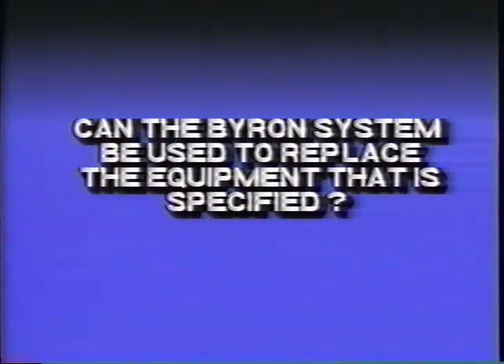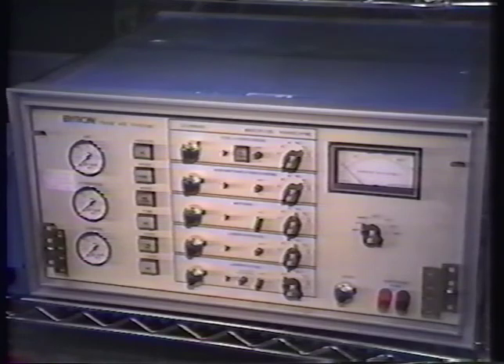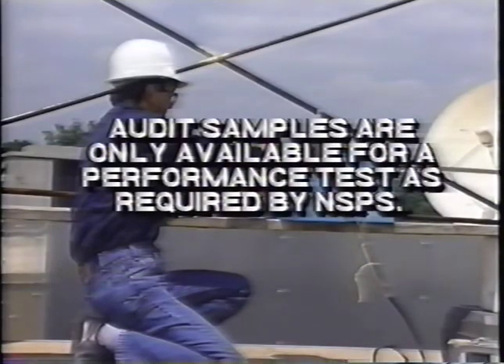Can the Byron system be used to replace the equipment that is specified? Yes, but all procedures required in Method 25, such as the quality assurance procedures, still apply. For what tests are Method 25 audit samples available? Audit samples are only available for a performance test as required by New Source Performance Standards, or NSPS.